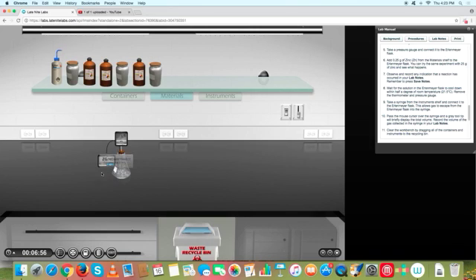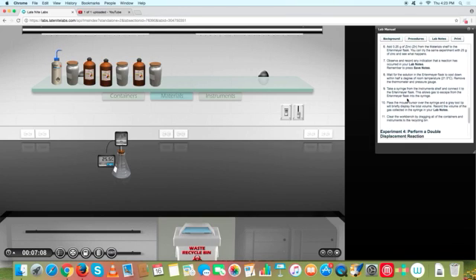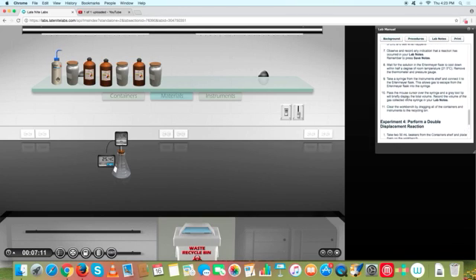You'll see there are going to be certain temperature changes and changes to the number of atmospheres, and it says to try this again with 25 grams as well and see what happens. So you can do that by yourselves.